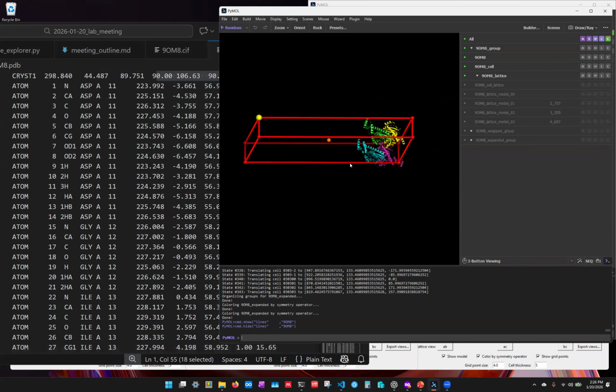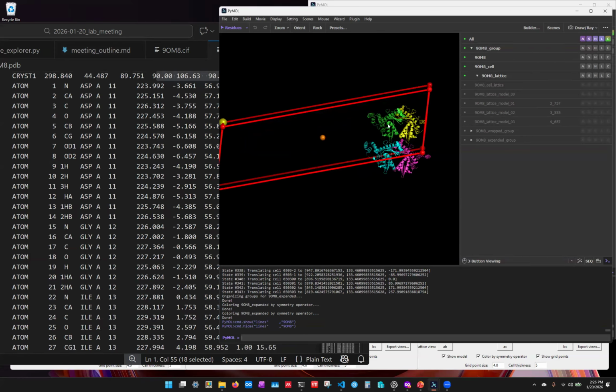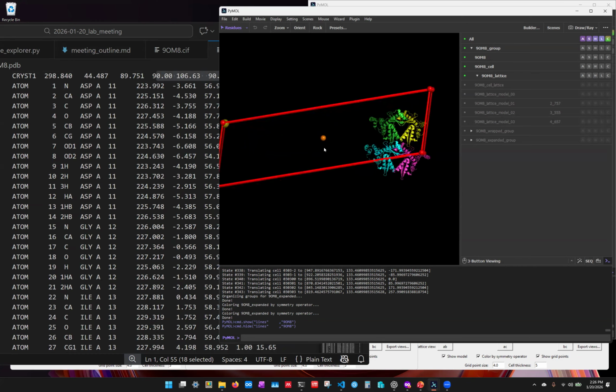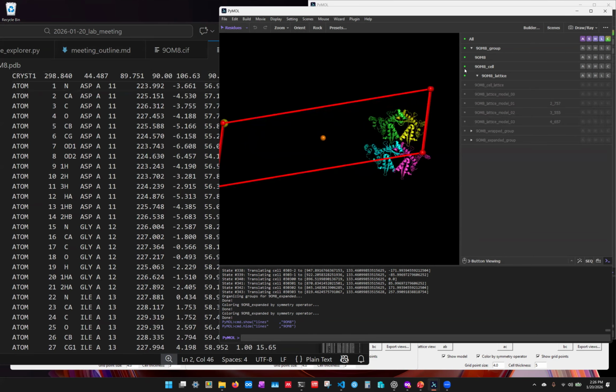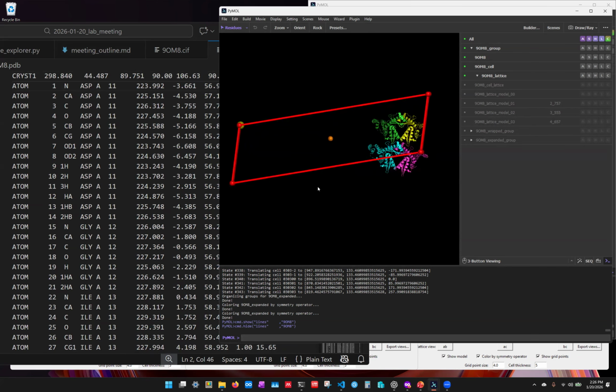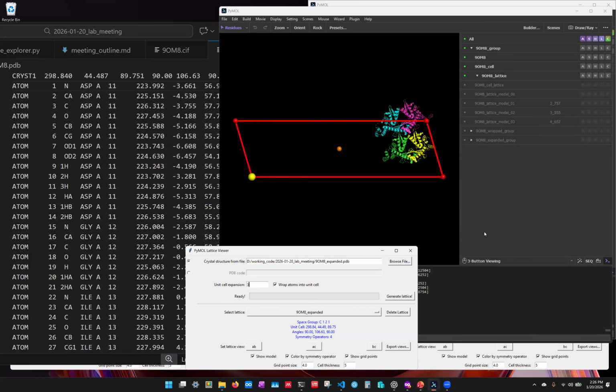Okay, so this still doesn't really look like much. This is still just 4 copies of PPRA in a unit cell. So there's one. Just to remind people, the unit cell is the basic repeating unit of the entire crystal, which you can recreate the entire crystal simply by translating in X, Y, and Z. So literally the most fundamental, translatable repeating unit.